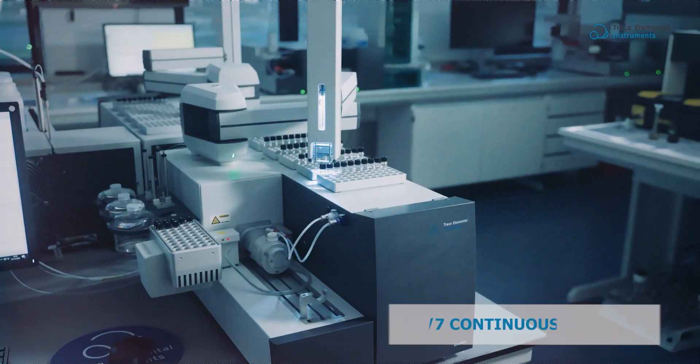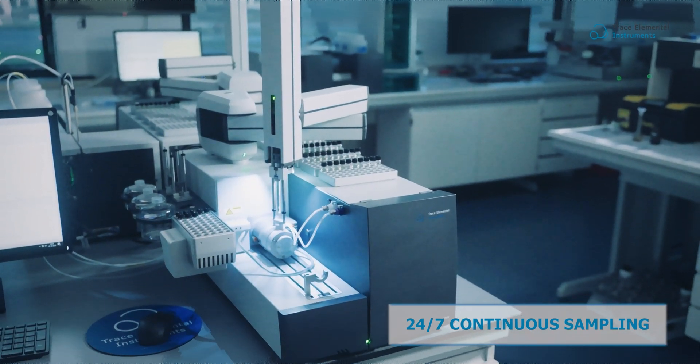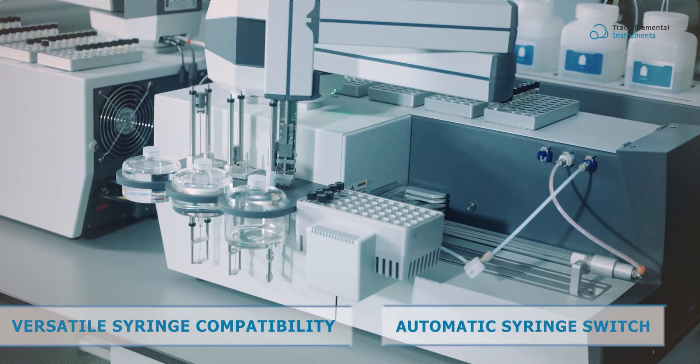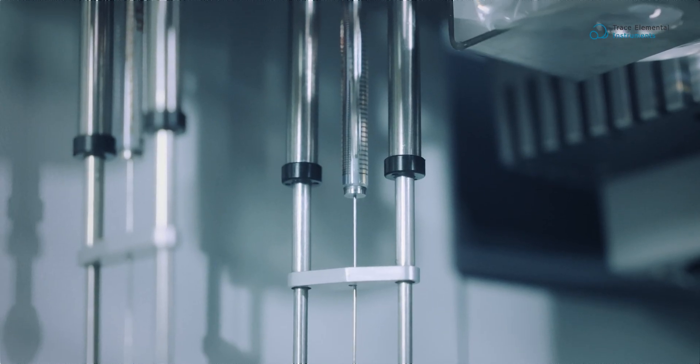No more pauses in sample processing. Vectra seamlessly handles continuous workflows. Revolutionize your flexibility with automatic syringe switch capability, allowing on-the-fly swapping on three designated positions for volumes between 10 to 250 microliters.